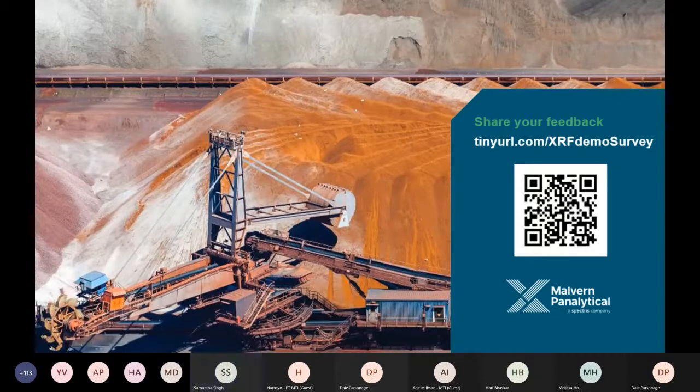Well, it obviously varies depending on the type of application that you're looking at. For an ore sample such as this, where we've got targets of iron, nickel, and cobalt, which are transition elements that are closely positioned, and then light elements that are also closely positioned, the instrument only needs to run 3 condition sets, which means we can have a very short analytical time.